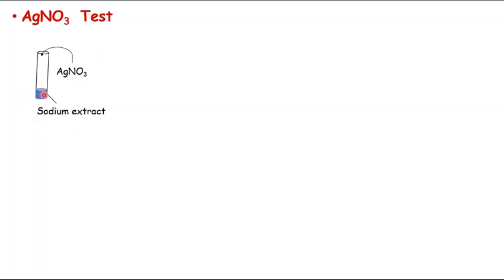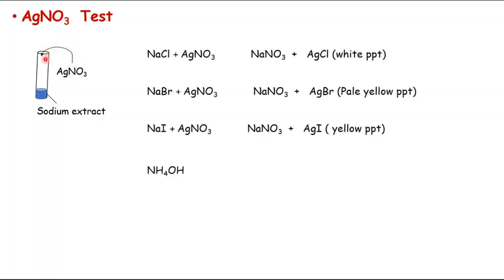The silver nitrate test: we take a test tube containing the sodium extract that we have prepared, and to this sodium extract we add silver nitrate. This is the first test for the detection of halogens — we add silver nitrate to the Lassaigne's extract.